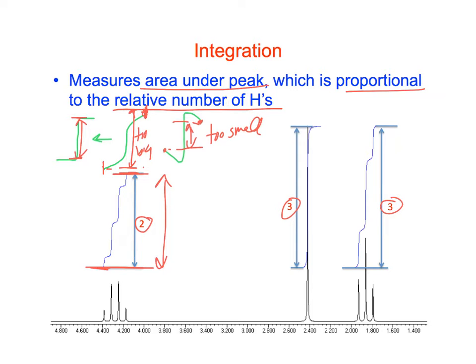So where there's no signal, it should still be flat on the integration, even if it's noisy. So maybe concentrate your sample more. Well, I think it's just a matter of adjusting these integration lines. Yeah, so that's just some stuff that we have to pay attention to.